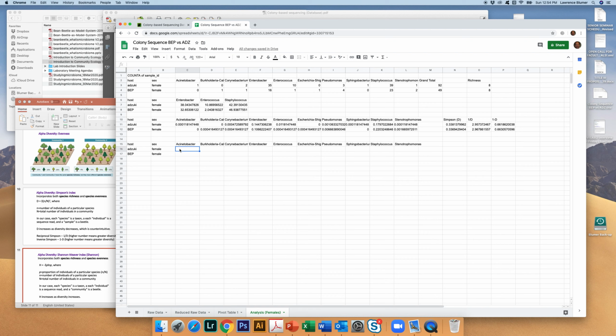So the way we're going to enter the calculation is a little bit differently. We're going to say, and this is the same in Excel as it would be in Sheets, we want that to be equals IF, and then do an open parenthesis, if this value, that is the actual count, is greater than 0.